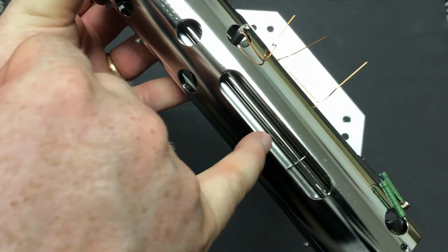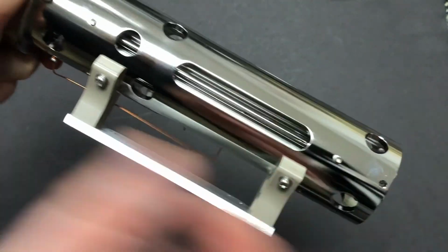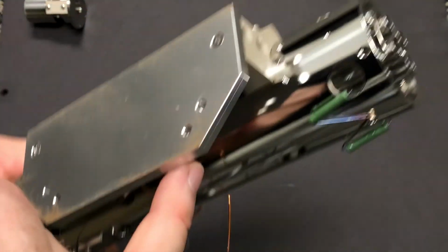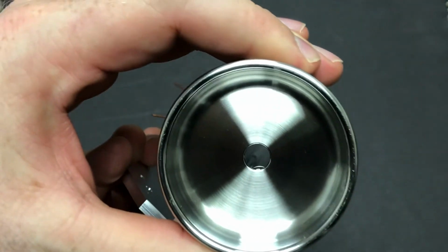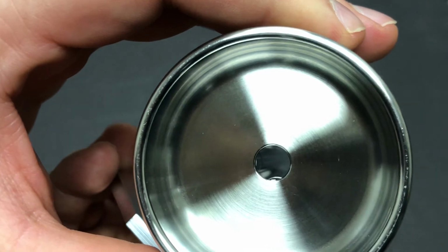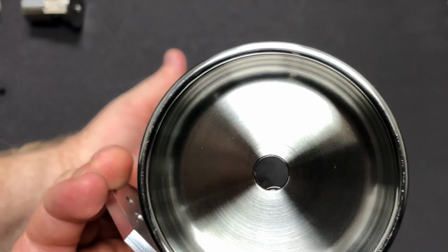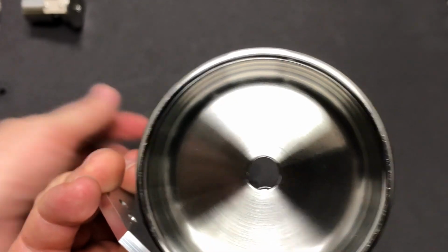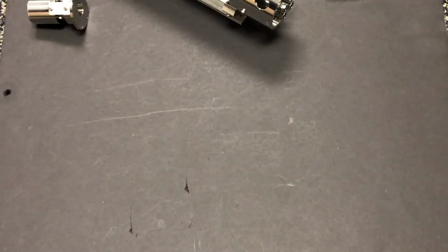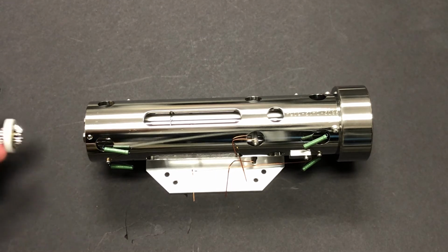We look at it from the top. It has the poles down inside, and it has shielding around the outside, that metal sheath. It's not like the naked octopole we saw before. And here's the other side, where it's got a bit of an optic that obscures the tubes, but you can see there's the hole. If an ion passes successfully all the way through that hole in the center, it hits the detector. If not, it does not. So let's make our own crude schematic here. We've got our quadrupole.